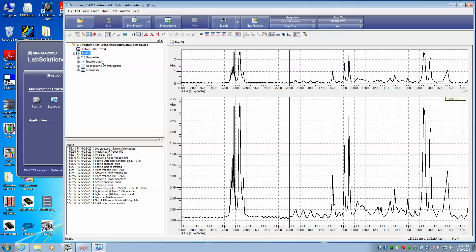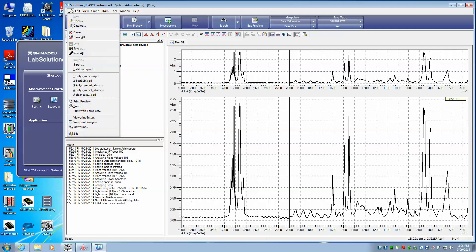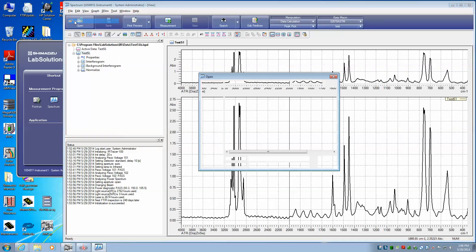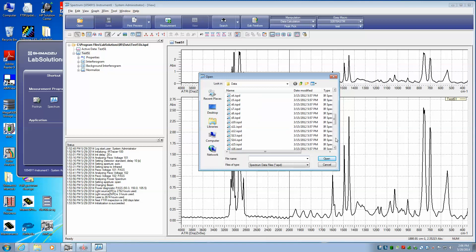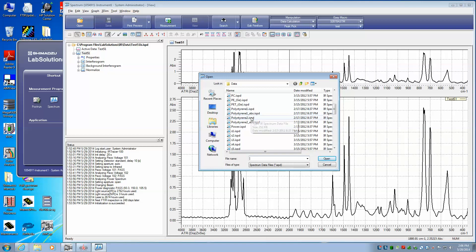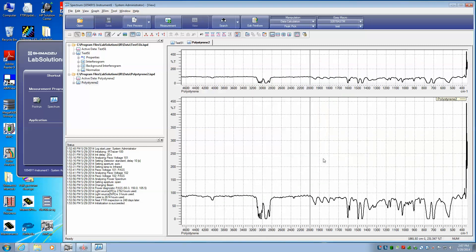Now let's say that we wanted to compare that to another polystyrene or to another sample. We would simply go to File, Open, and select the other sample that we would want to load. In this case, I'm going to load polystyrene 2. Select the file, select Open, and this opens the file.